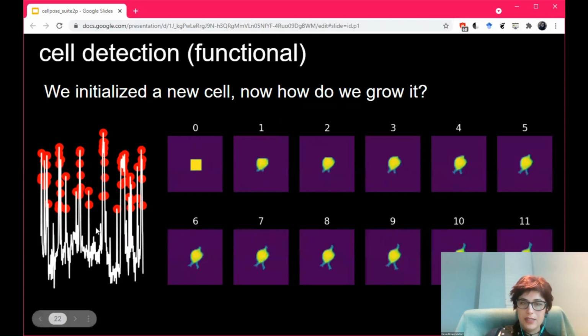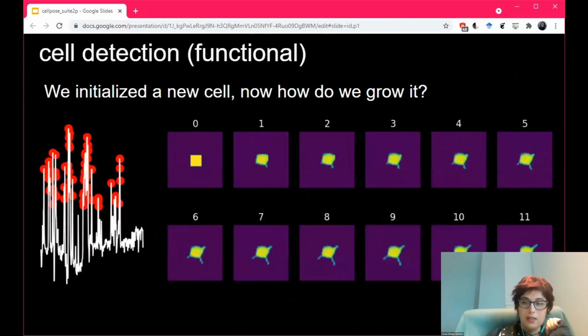And then this is actually a cell that's pretty active throughout the recording. You can see these cells kind of grow. This cell starts to grow as we average these frames. You can see these little dendrites grow. And so on each of these iterations, we check the pixels within the box and then every surrounding pixel of each pixel to see if they should be included or not. In this case, there are some pixels outside that should be included. In this other case, there are other pixels outside that should be included. So this allows us to learn complex shapes from these seeds, basically.